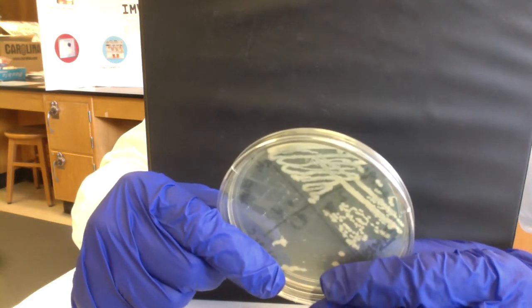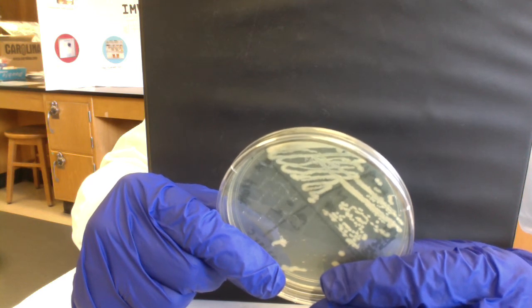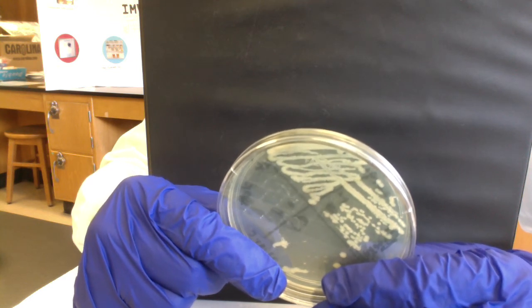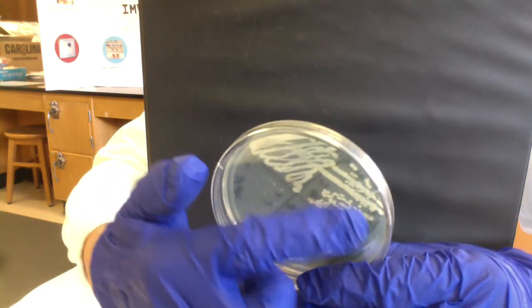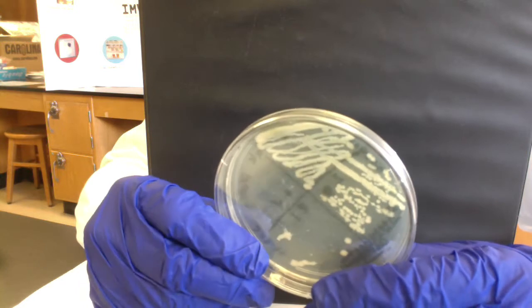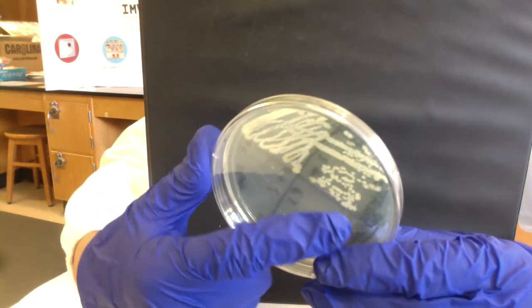The trick was, we sterilized our loop, we didn't get another loopful of broth, we sterilized our loop, cooled it, and then pulled some of the bacteria from quadrant one into quadrant two and streaked them out over the surface. You can see we're starting to get them separated, almost seeing some isolated colonies in quadrant two.